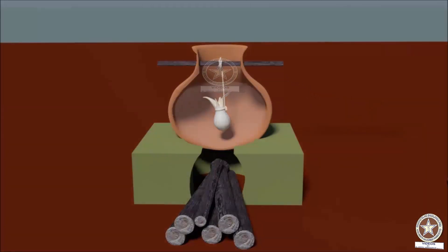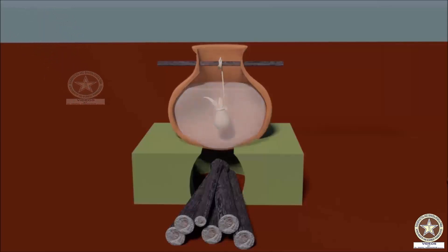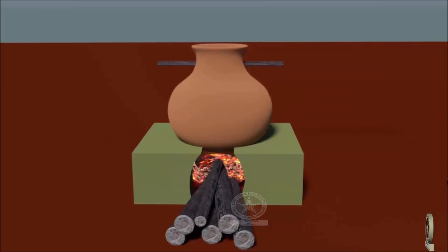The liquid medium is filled up to half of the pot such that the potali is immersed completely in the Dravadravya — here it is Kshira. Fire is lit and heating is started. Heating is to be carried out on Mandagni, that is mild fire.